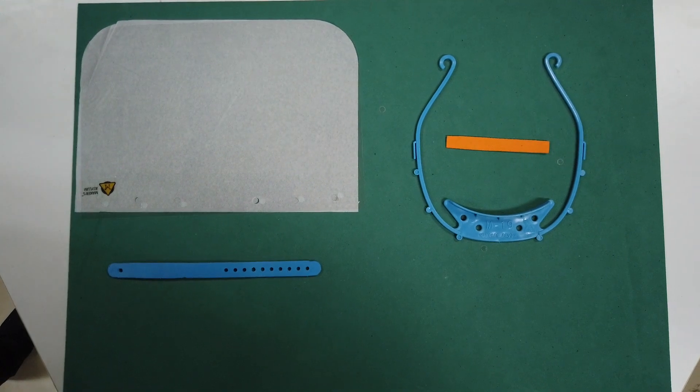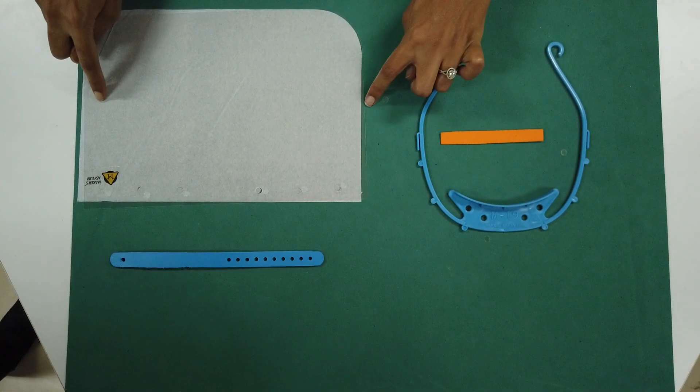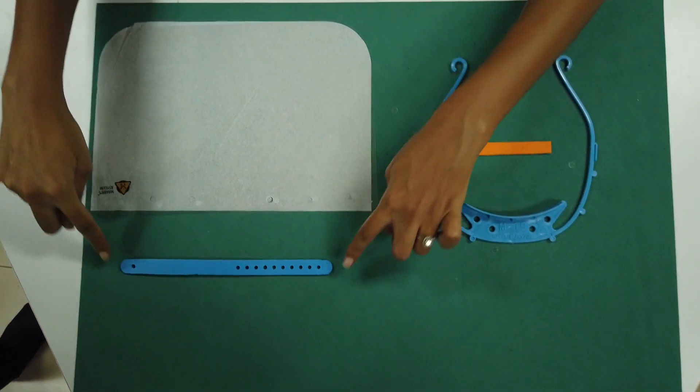This is the M19 face shield. That's the headband, that's the comfort foam, that's the front visor which is replaceable, and that's the head strap.